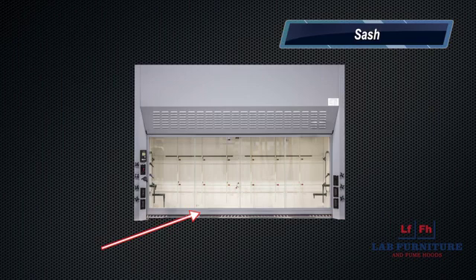Variable air volume hoods maintain a constant velocity at any sash height. Now, that doesn't mean that you should keep your sash open high. We always want to work at a safe 18 inches or lower with our sash. This will help protect our face and our body.